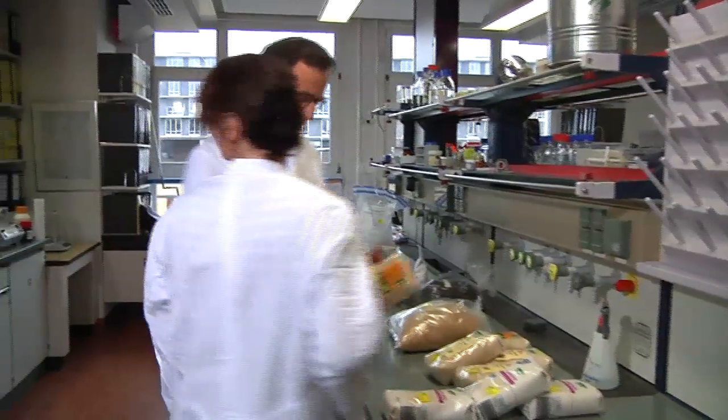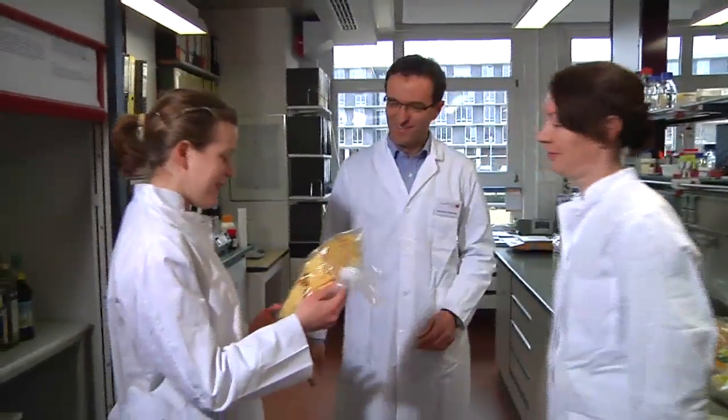Hello Mirjam, hello Uli. I've got a bag of tortilla chips with me. Would you be able to analyze them, and would that make any sense? We can definitely do that and it makes total sense. Genetically modified maize is extensively grown in North and South America and also in Europe in some countries. Therefore I'd suggest we have a closer look at these crisps.